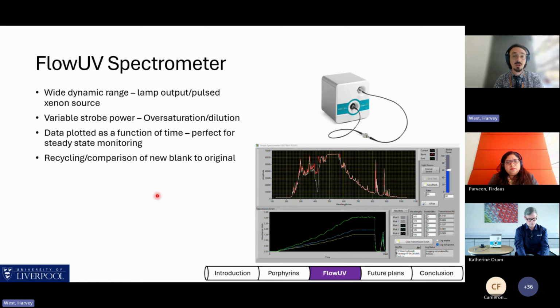We're also able, through the use of switching valves, to purge our flow cell and pump our blank solution through, comparing our current blank measurement to our recorded blank measurement shown in red, allowing us throughout the day, and this is particularly helpful for long experimental runs, to assess if there has been any deviation. Because sources heat up, as do detectors, but also an awful lot of ambient conditions in your workspace can change throughout the day as well. Temperature, pressure, transient light, for example.